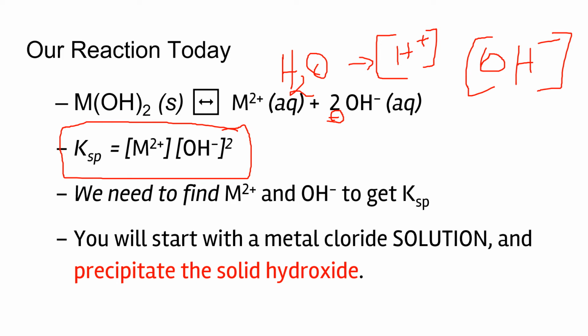And so how do we calculate the KSP? One, we need to find the concentration of the cations in the solution, and we also need to find the concentration of the OH in the solution, and we said we are going to use pH measurements. Well, pH is related to the pOH, which will help us to find this number here. And then we have a starting value of the concentration of our solution that will enable us to find the other number here. These two should be multiplied together, and the OH concentration is raised to the power of 2 to go back to the KSP.